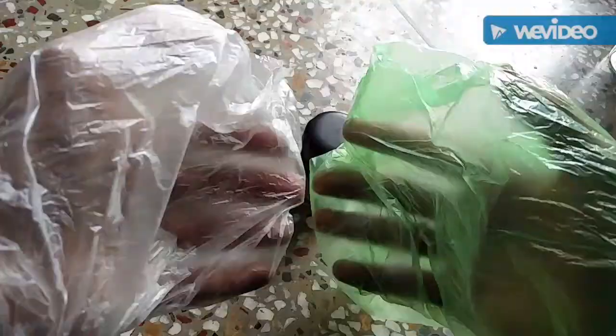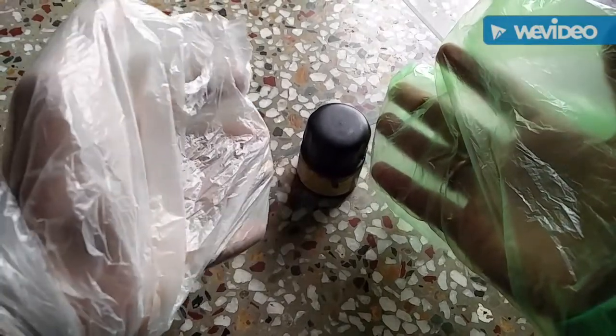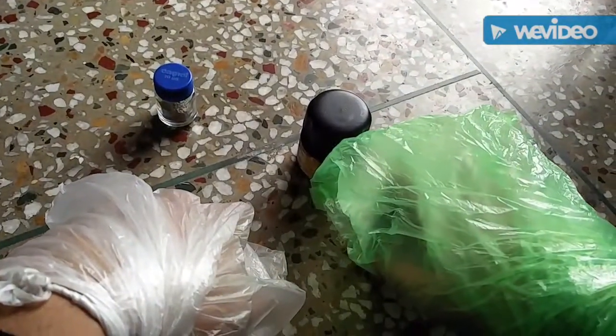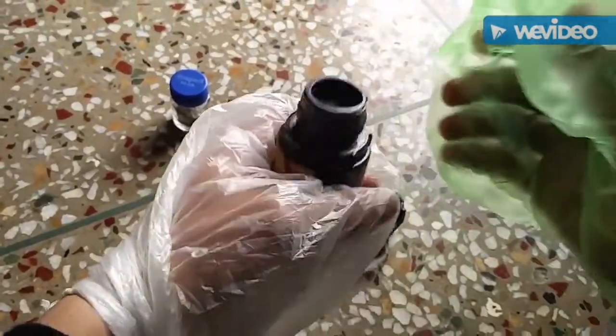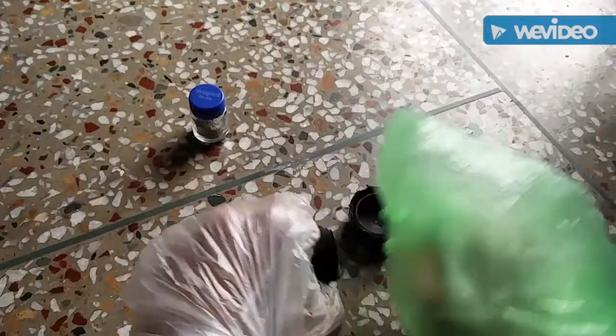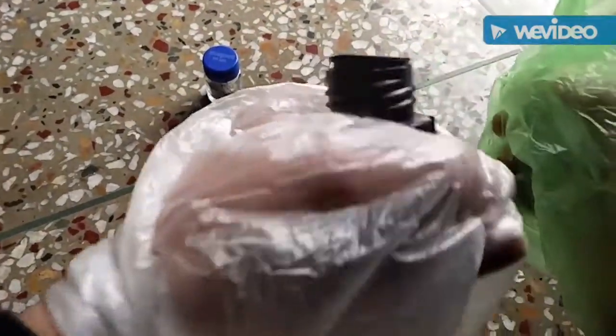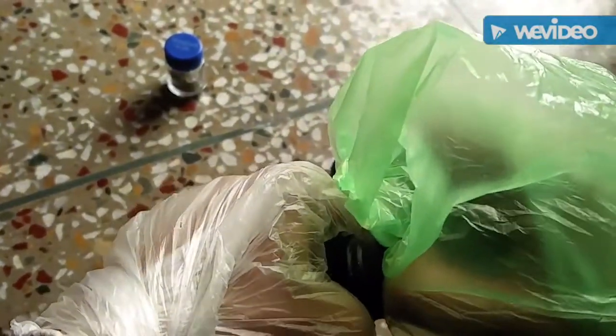So let's get started. You might want to have some protection — this was the best I could get because I tore my gloves. Just open the silver nitrate container carefully and you'll see there's another cap that you have to lift. It is quite hard to take it off, and you want to do it slowly.